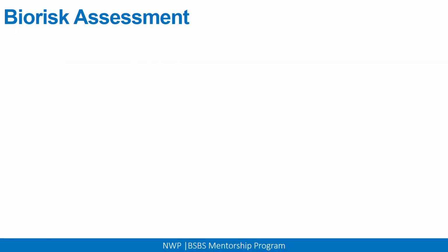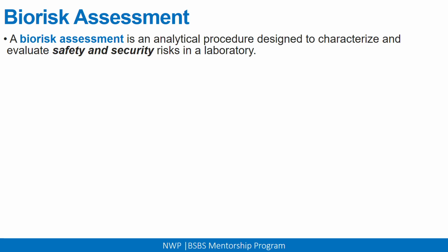Now let's look at some definitions of what biorisk assessment is. We already defined it in session 7. A biorisk assessment is an analytical procedure designed to characterize and evaluate safety and security risks in a laboratory. Like we said in session 7, it's an analytical procedure. It means that there should be something that you're analyzing.